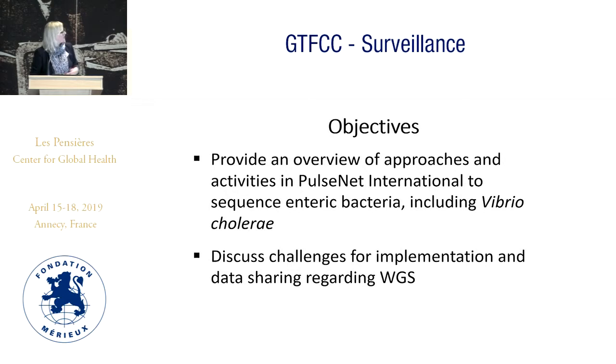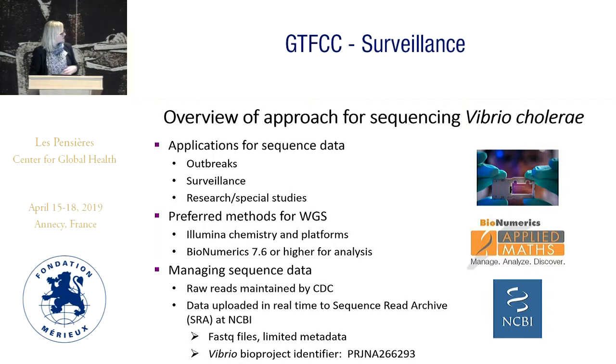Okay, so I kind of just went over the objectives for you. And at the end, I'll talk about some of the challenges we've come across for implementation and our policy for data sharing regarding WGS. So here's an overview of our approaches for sequencing Vibrio cholerae. And this applies for more organisms as well.